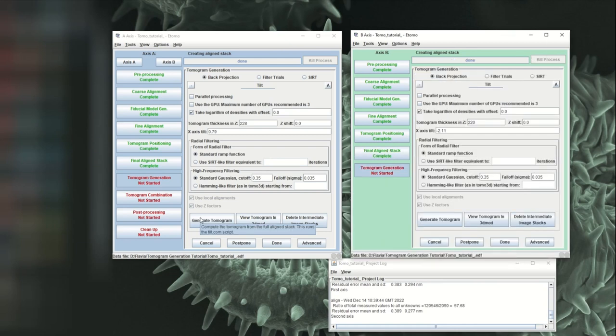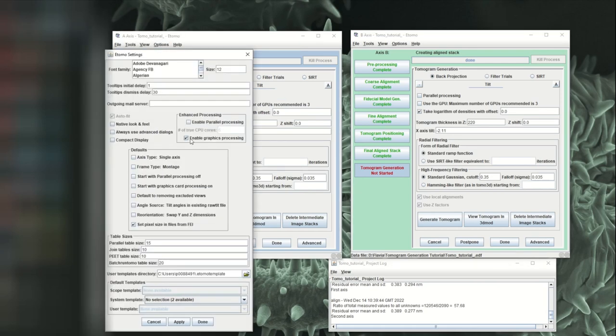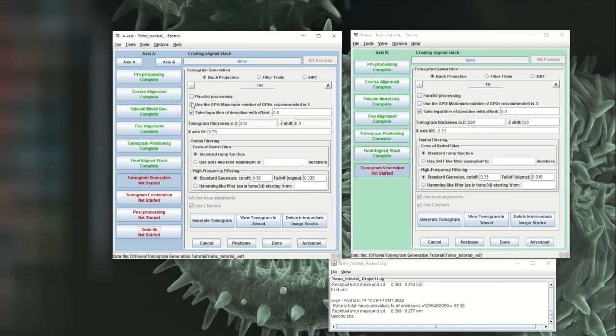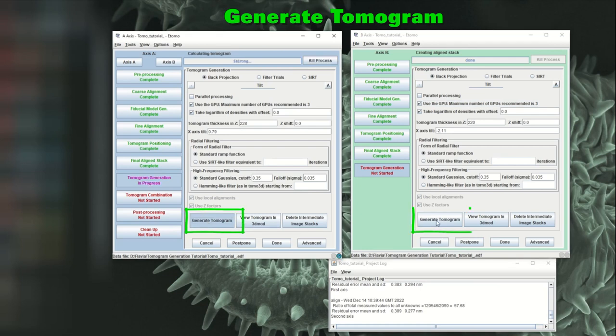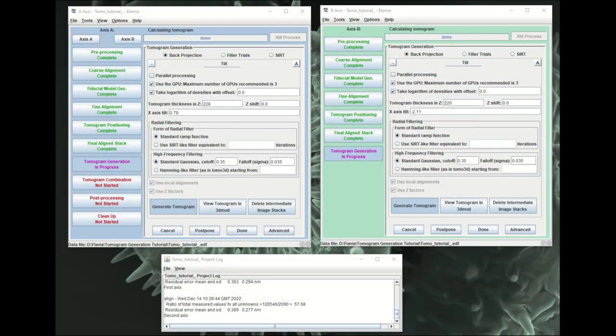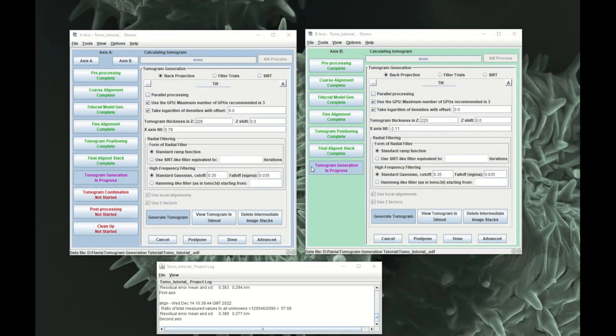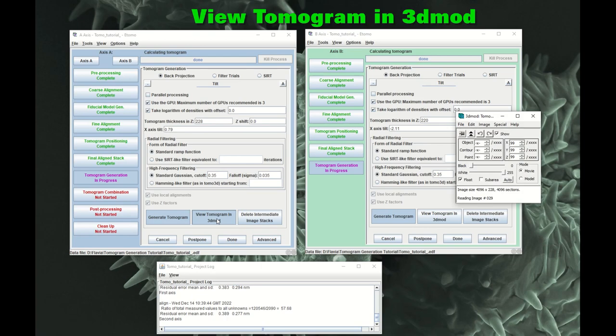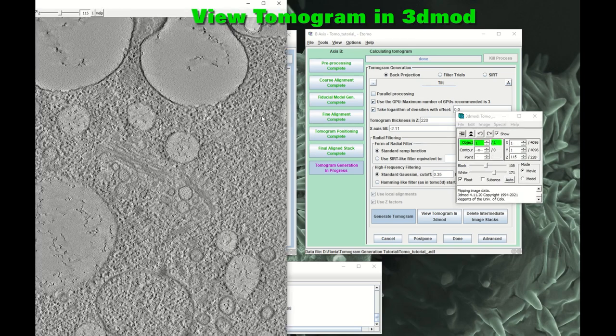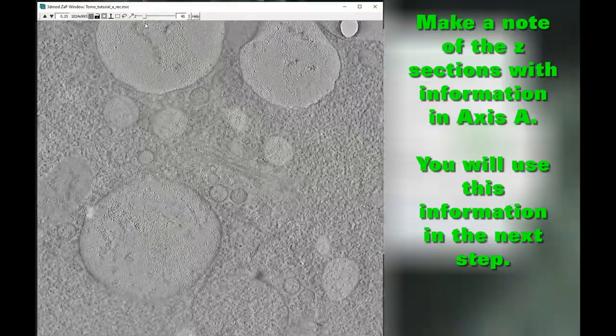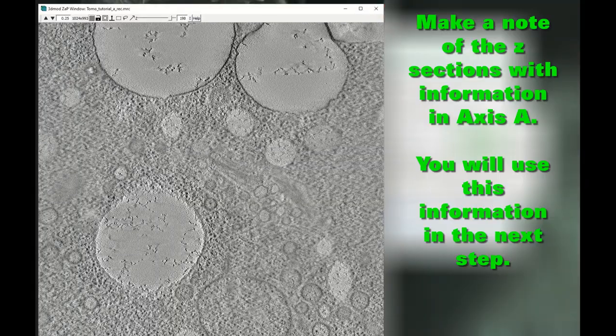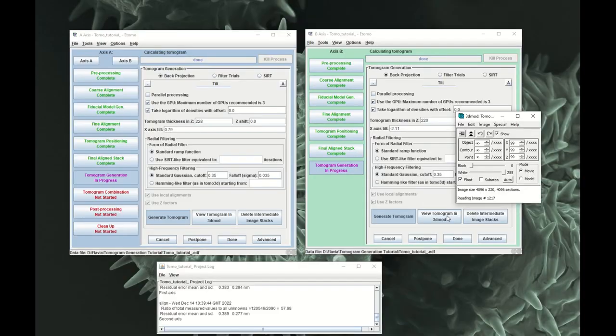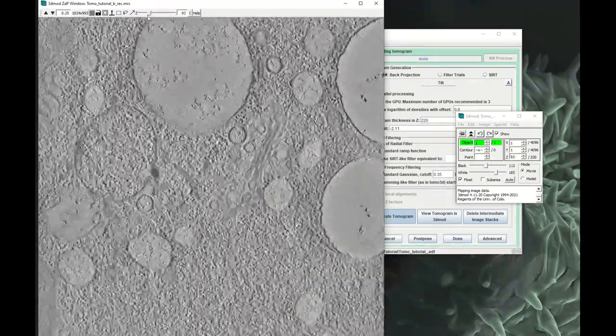And now we will generate the tomogram. I think in my options here, let me see what I've got. Enable graphics processing. So I'm going to click on Use GPU with the maximum number of GPUs. And see how it goes. So generate tomogram. And then we can do the same with the B axis. So now tomogram generation is finished for each of the axes. Let's view the tomograms in 3D Mod. It's important to view both tomograms in 3D Mod. For axis A, make a note of the Z sections that contain information, as this will be important in the next step. Both tomograms will have some stretching, but of course this will disappear when the tomograms are combined into a single dual axis tomogram.